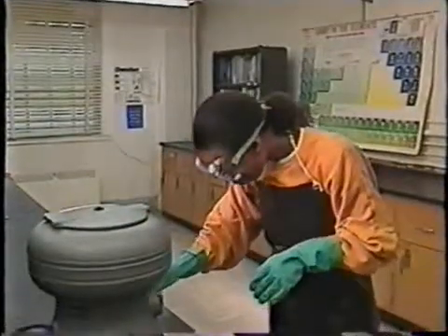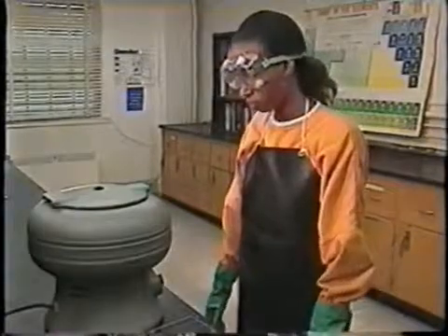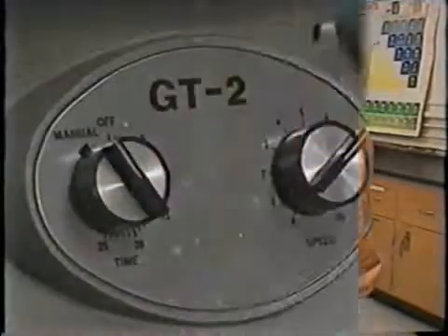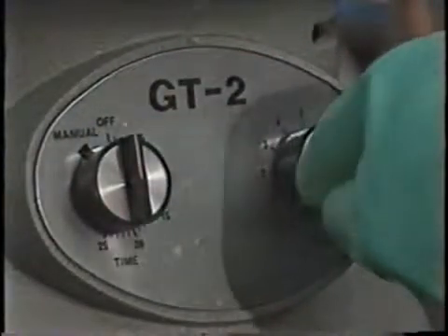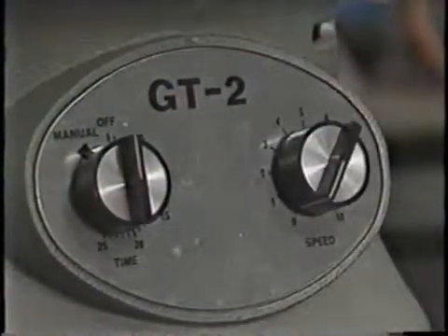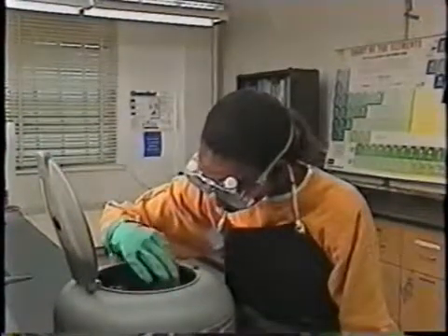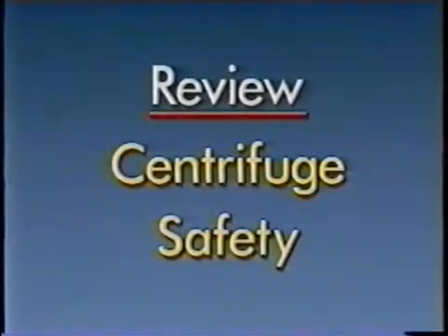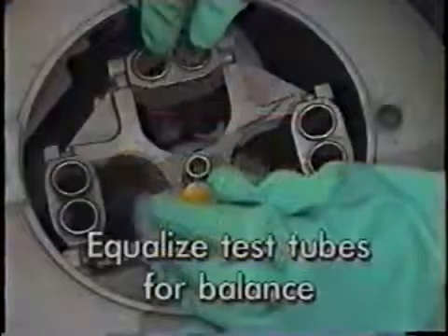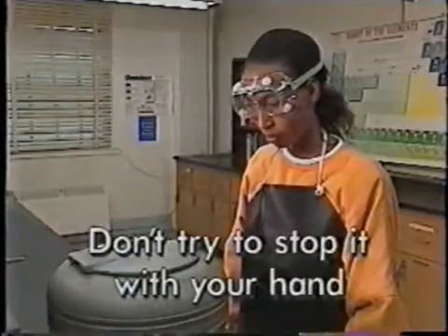Once the centrifuge is balanced, you can turn it on. When it's finished, turn it off and wait until it stops spinning on its own. Never try to stop a centrifuge with your hand. Place equally filled test tubes in a centrifuge to balance it, and don't try to stop the spinning with your hand.